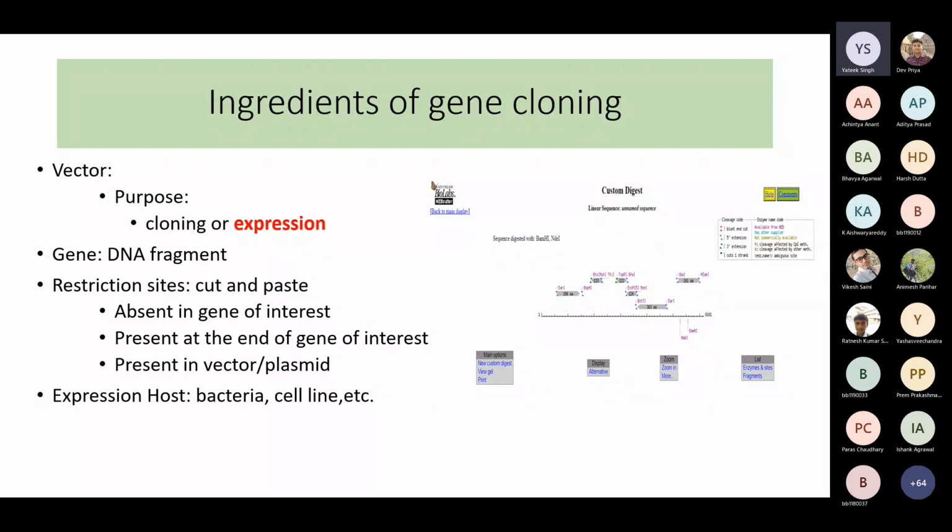The transcription unit is there, promoter, transcription, stop codon, everything is there, so that it makes a functional gene expressing our protein.